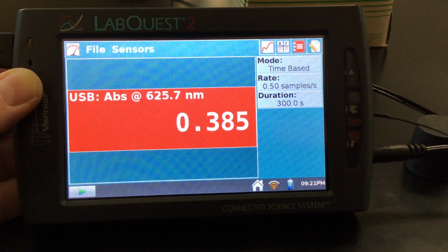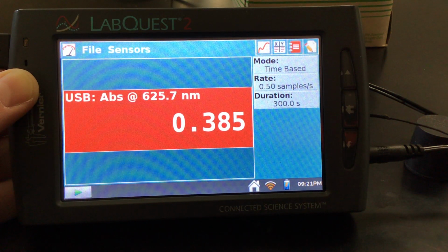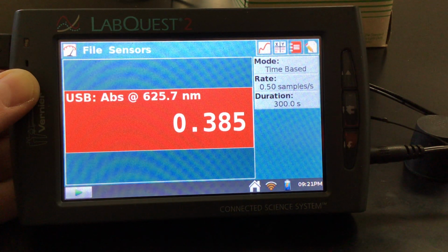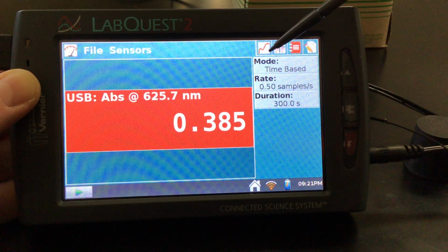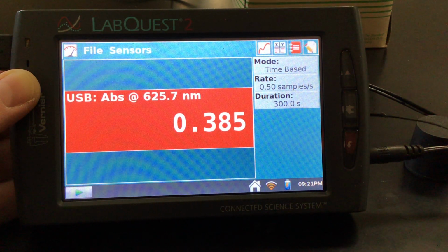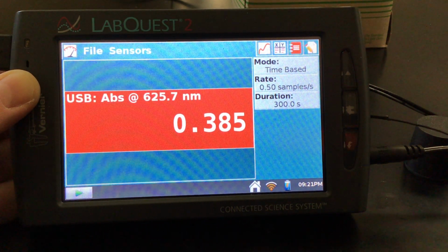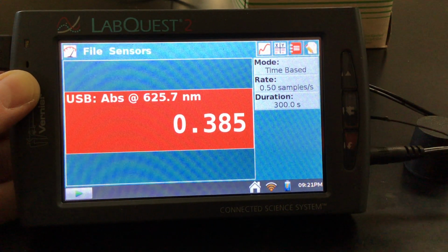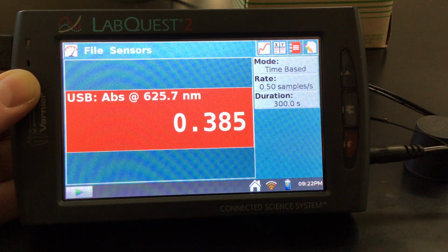That's where we were. Now, when you guys do this, when you hit OK, it's going to prompt you to save it, and you come up with a file name that you're going to save. And then we're ready to collect our data. At that point, once you have a screen like this, you'd have poured your sample from your cuvette back into your beaker. Add 2 milliliters of bleach to it, give it a quick swirl, pour that into a cuvette, and collect your data.